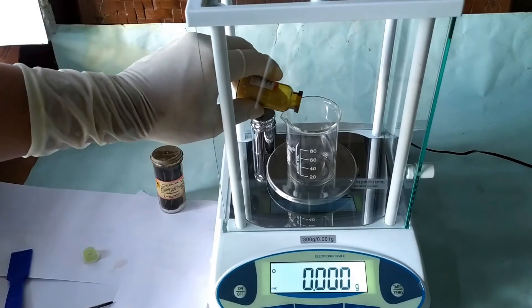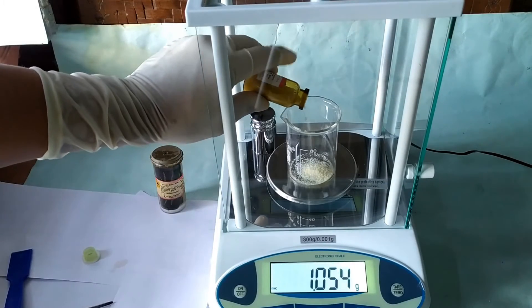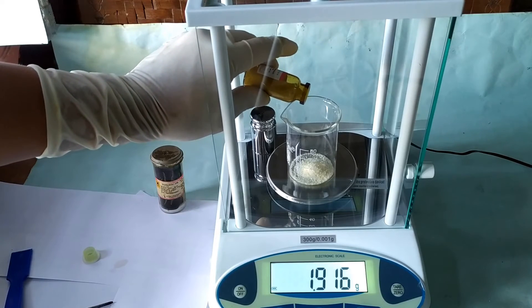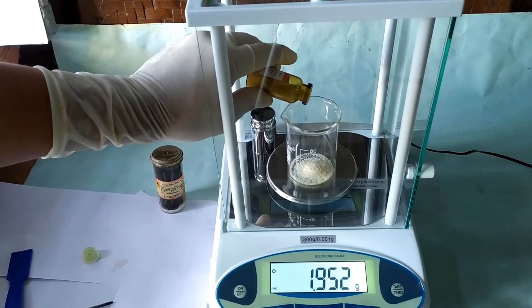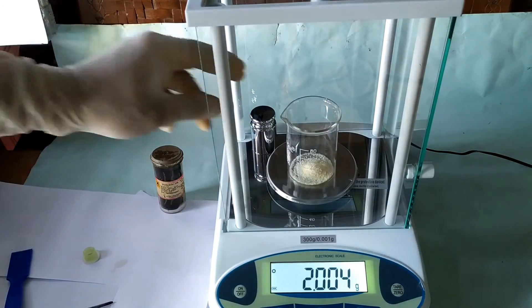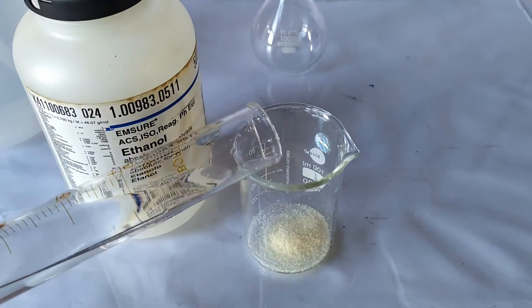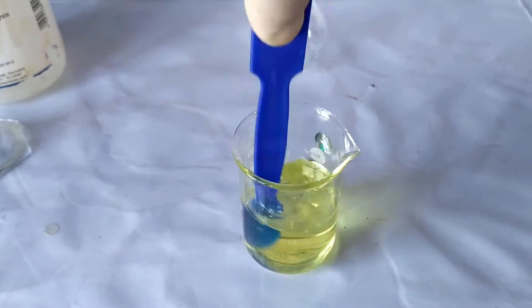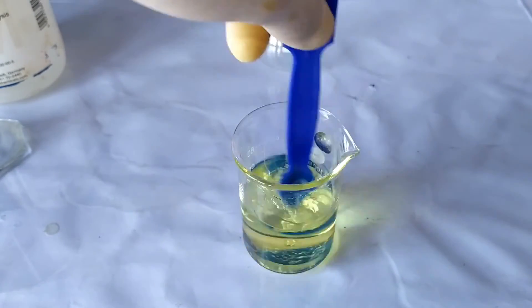To begin, first weigh exactly 2 grams of ninhydrin in the 100 ml beaker. Add 30–50 ml of the solvent of choice and stir to completely dissolve the ninhydrin. I'll be using absolute ethanol for this.